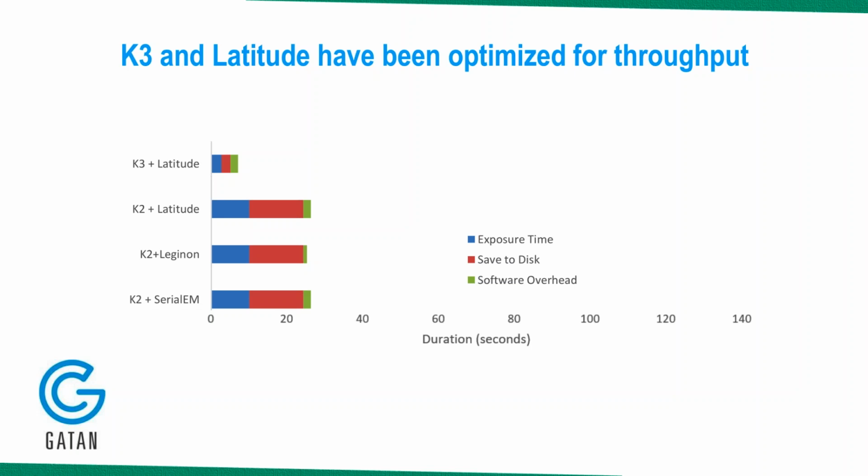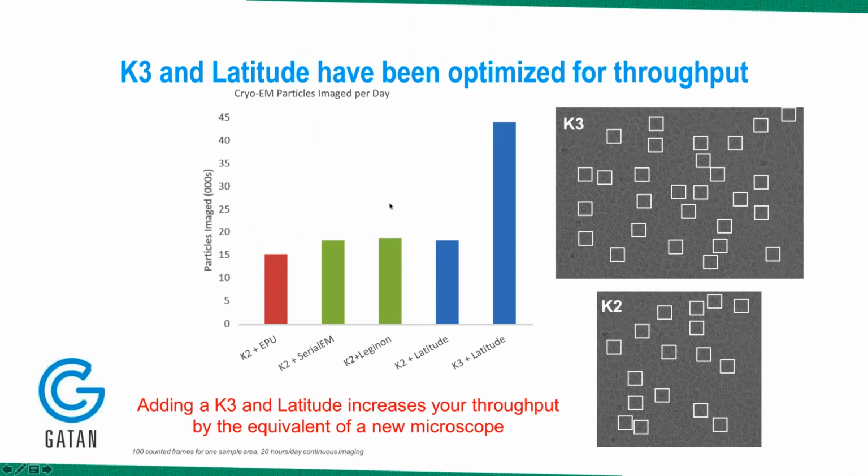It's a very fast camera. And not only that, but the infrastructure with it, the processor and the software are a little faster. And also, the images are larger, right? The field of view of the K2 versus the K3 is about almost, I think it's about 40% increase.